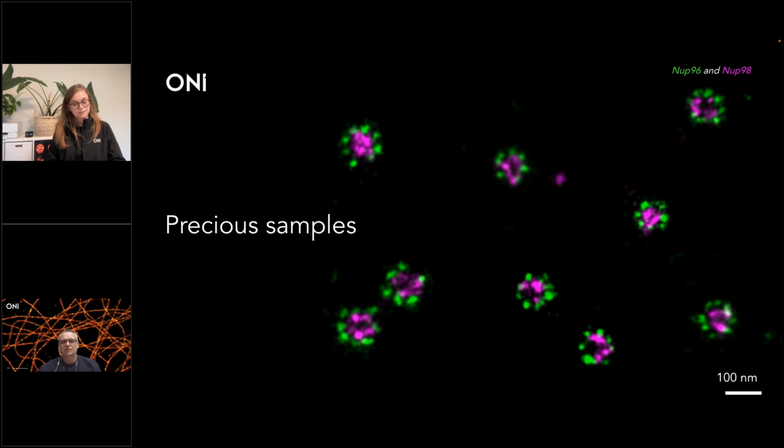So as you isolate your cells from bone marrow and prepare them for FACS, please do the same thing for flow cytometry: take the same samples and place them on a dish which has a polylysine coating, and wait 15-20 minutes. You can look at the dish in a tissue culture microscope and see whether your cells are already settled. And if they are settled, just follow the fixation protocol. Which fixation to use will actually depend on your protein of interest. You will need to check it out. There are two main ones, as I mentioned earlier: PFA, paraformaldehyde, or a paraformaldehyde and glutaraldehyde combination.